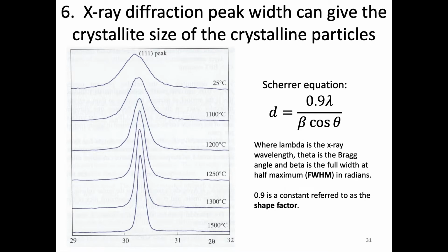So we're going to use 0.9, but sometimes when you do this in X-ray diffraction software, you may use a slightly different constant based on the machine or the calibration of everything. But 0.9 is a good approximation for us. So using all that, that's all really constant for a peak. And so the only difference then is the width.